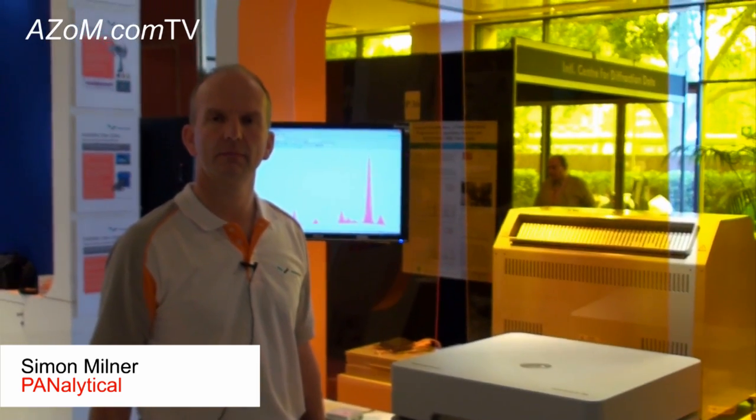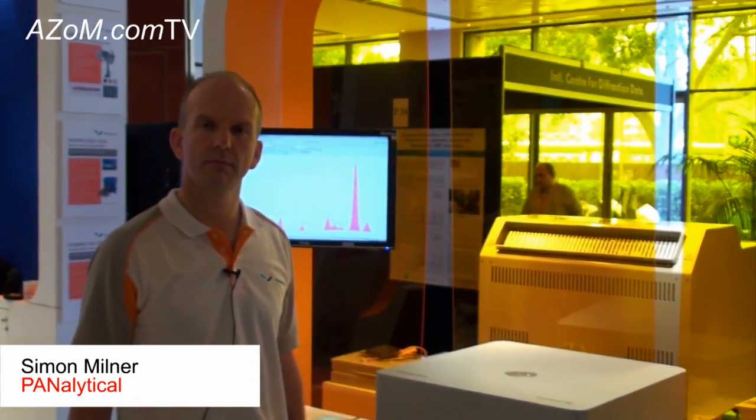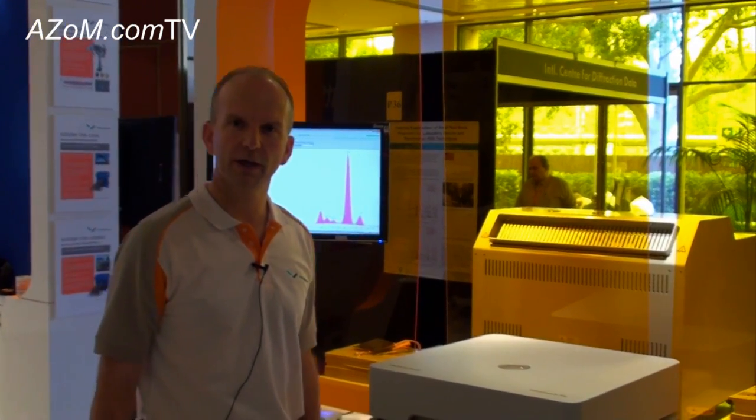This is Cameron Chai from AZoM, bringing you another episode of AZoM.com TV. Today we're speaking to Simon Milner from Panalytical. He's going to tell us about their Epsilon 3 XL XRF system. Good morning, Cameron.